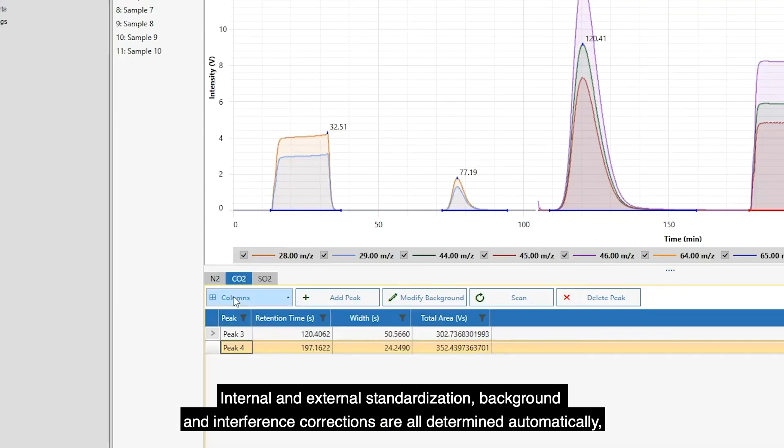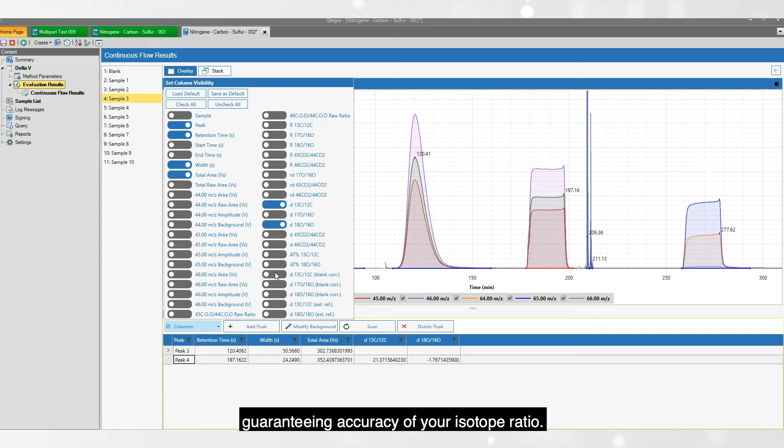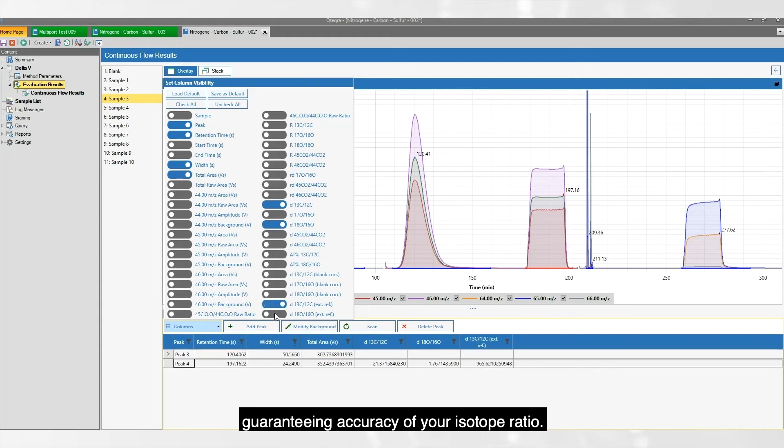Internal and external standardization, background and interference corrections are all determined automatically, guaranteeing accuracy of your isotope ratio.